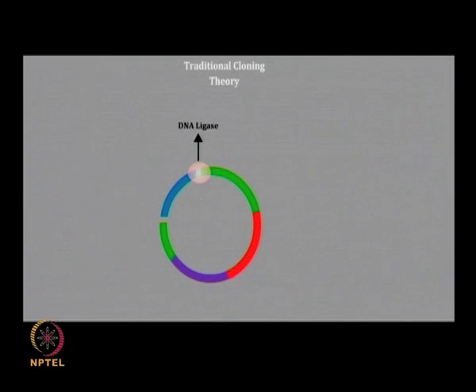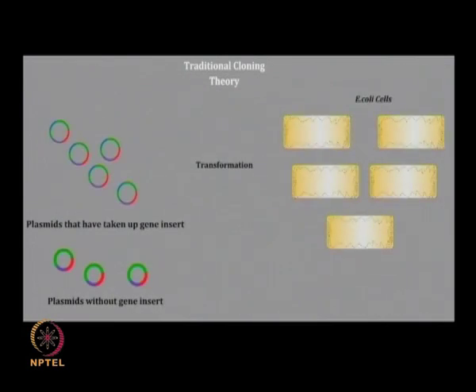The complementary sequence overhangs that are produced in the plasmid and gene insert during restriction digestion are useful for proper orientation of these fragments during the insertion.